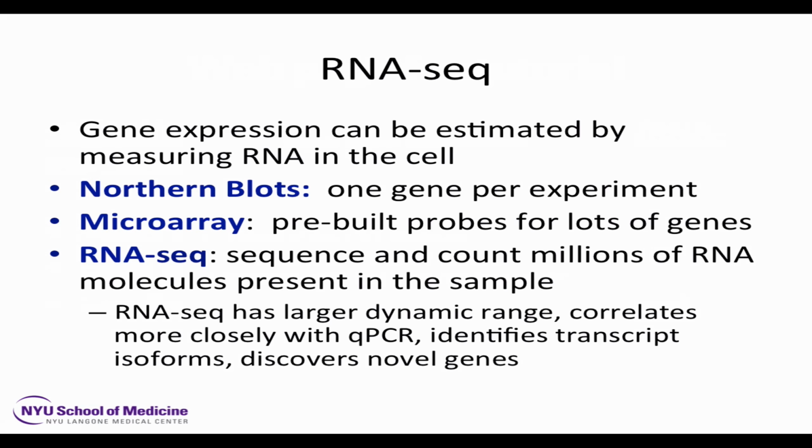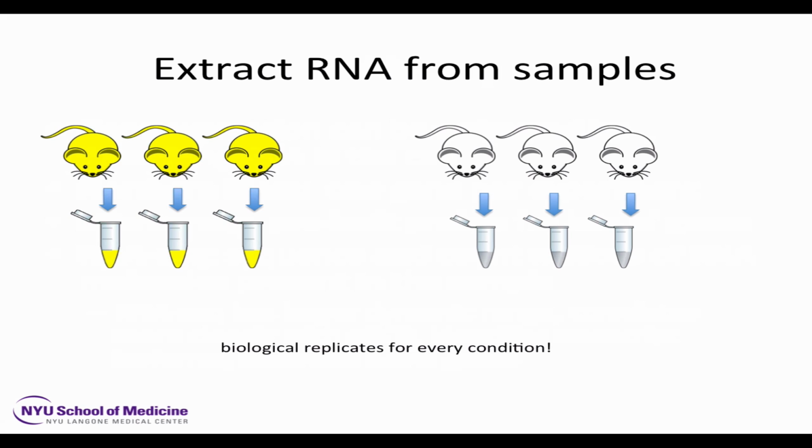Today's workshop is extremely simplified, and I'm just going to take you through one very basic workflow, which hopefully empowers you to start exploring your data, and from there you could choose to learn more advanced computational methods or engage in a more well-educated conversation with bioinformatics experts who you recruit to help you work on your data. So those are our goals for today.